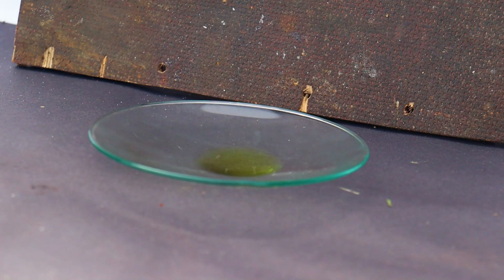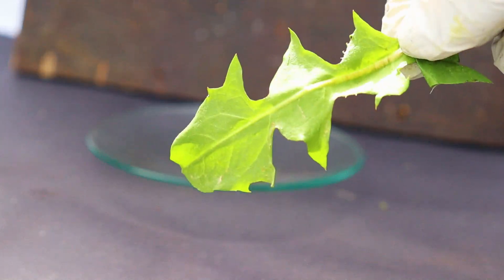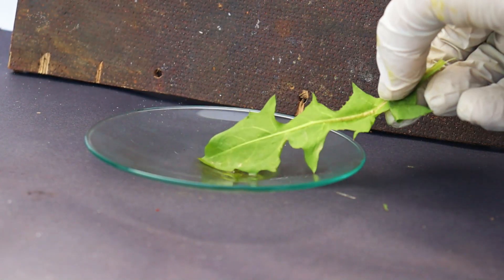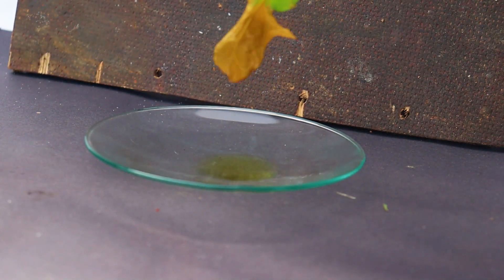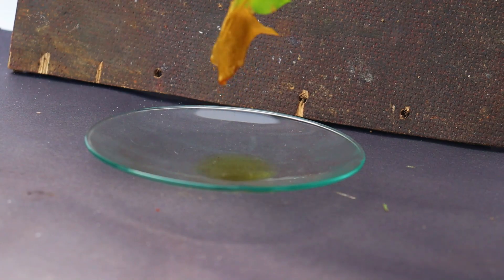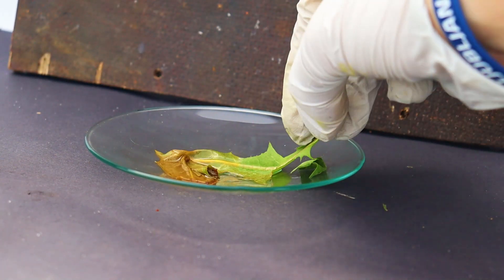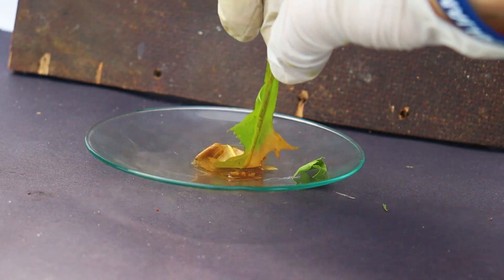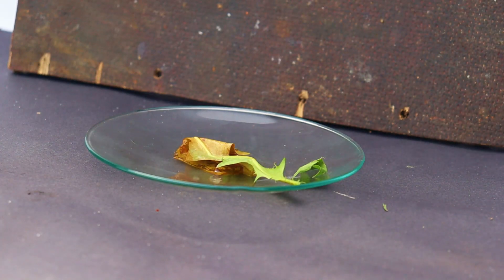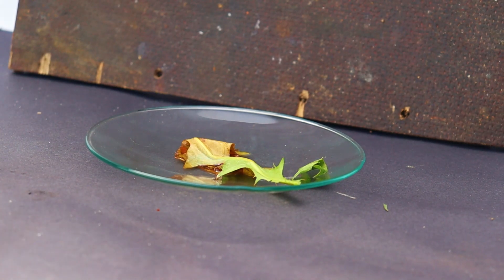As previously said, it's an extremely strong oxidizer — in addition to igniting things, it can tear them apart too. Have a look at what it does to a dandelion plant leaf. The leaf immediately turns brown and starts to disintegrate. It's quite terrifying to watch.